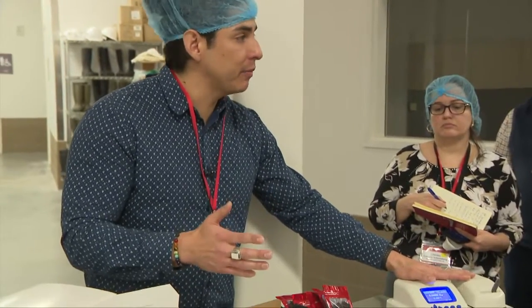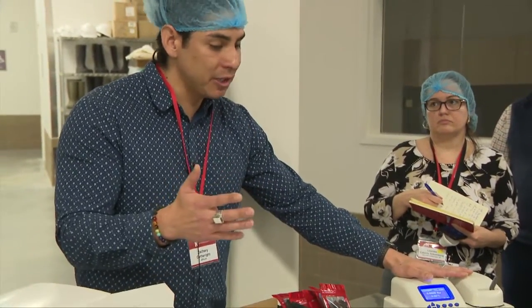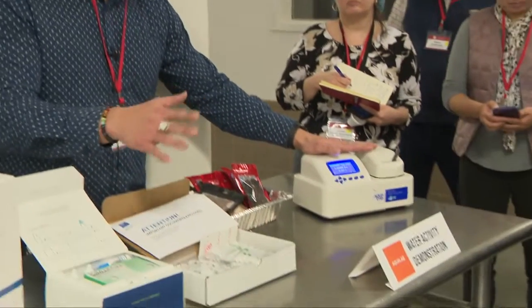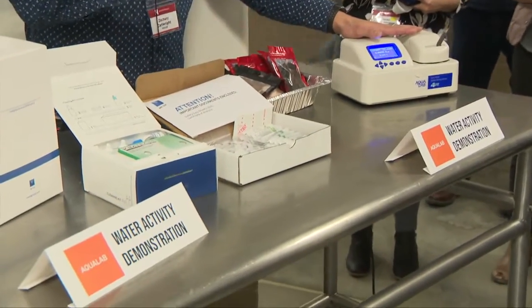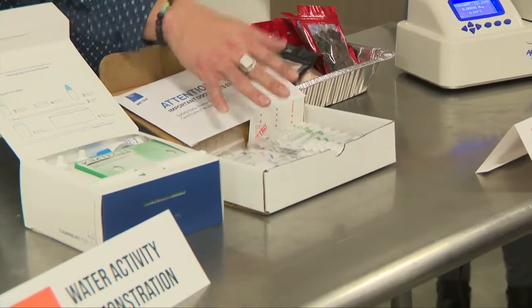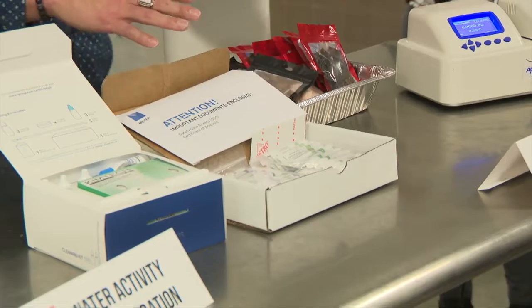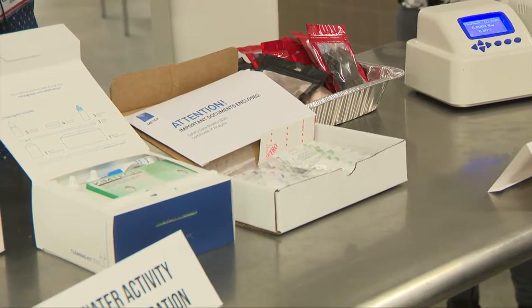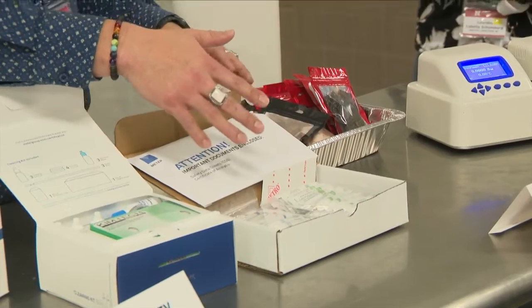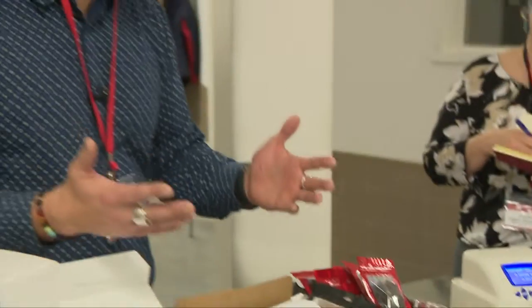Something else that makes this device stand out above moisture content is that it comes with standards — salt solutions that we produce where we know with a really high degree of certainty what their water activity is. You can use these to check your device and make sure the calibration is verified. A lot of companies will use this maybe every shift or every 50 samples or so.